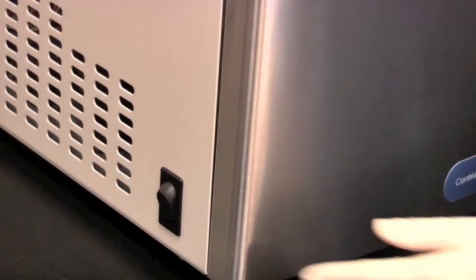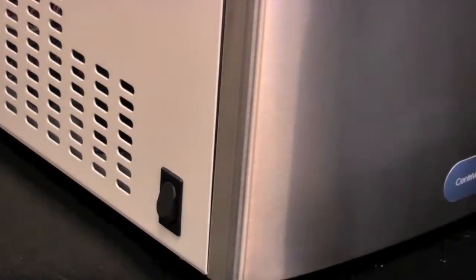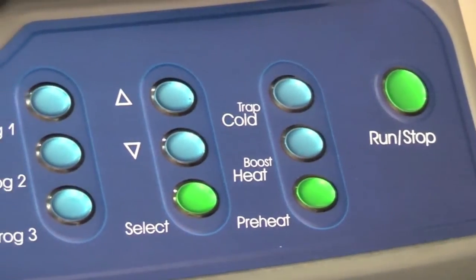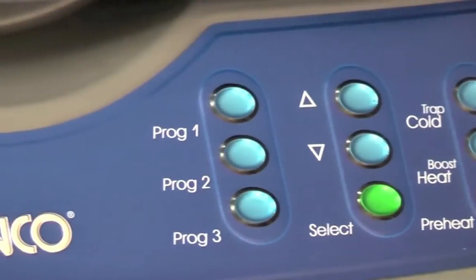Using the CentriVap Complete is simple. Turn the system on. Press the cold trap button. When the indicator goes from blinking to solid, the cold trap is ready.